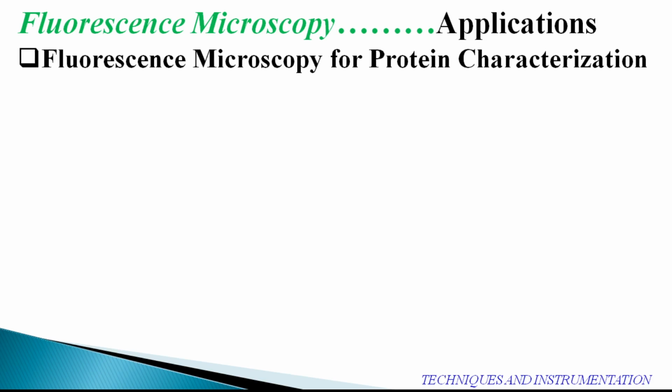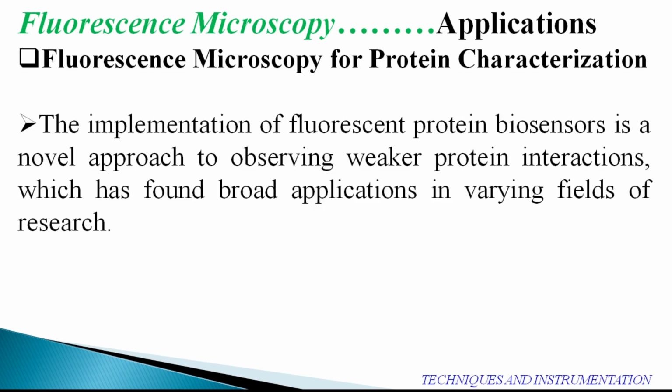Just now I told you why there are weak proteins, and why weaker signals may get produced. If you are using a good quality of biosensors, which are capable of detecting the fluorescent protein interactions by detecting that particular signal, which is very weak, even then it can be detected due to the newly discovered use of biosensors.